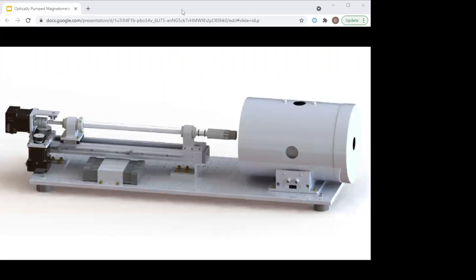This is the new instrument that we currently have on the market. We're calling it the Model 110 OPRM — for Optically Pumped Rock Magnetometer. It consists of the automatic sample handler, magnetic shielding, the magnetometer sensor, as well as operating electronics and computer and software controls.